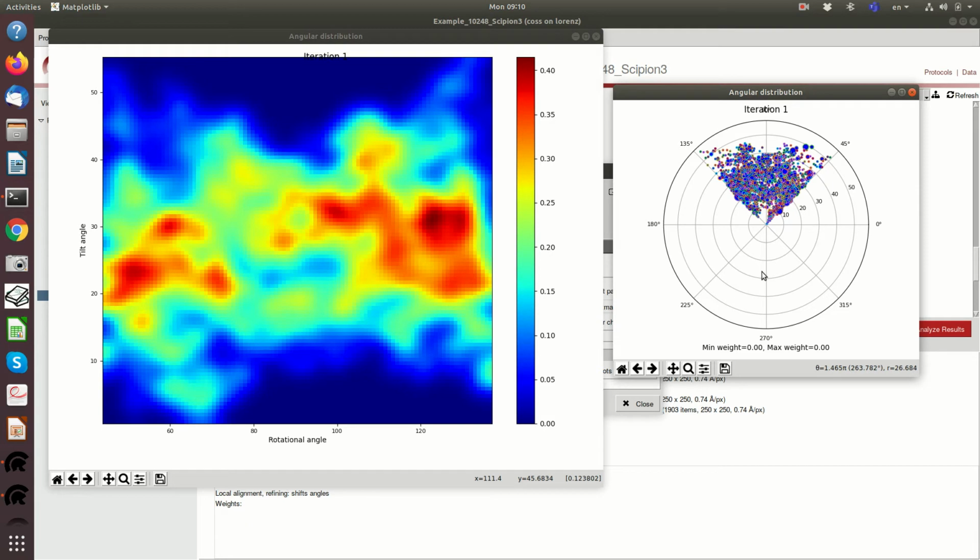The fact that you don't have any particles in this area is because of the octahedral symmetry, so you don't need to cover the full area, because every particle has a number of equivalents. I don't remember exactly for the octahedral symmetry, but each one is replicated in the projection sphere. Within the asymmetric unit, you should cover it as well as possible, as homogeneously as possible. It is not perfectly homogeneous, but it is not bad either.